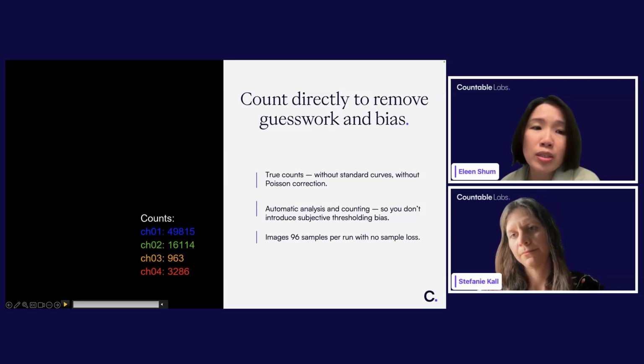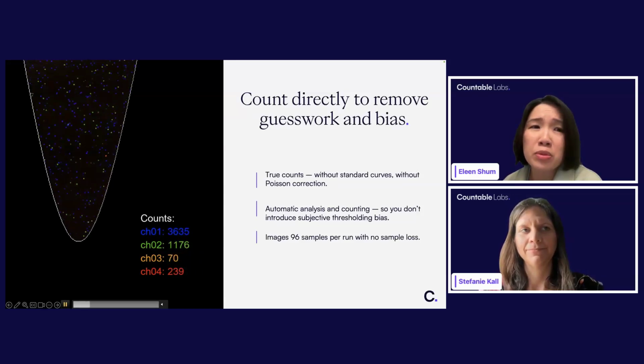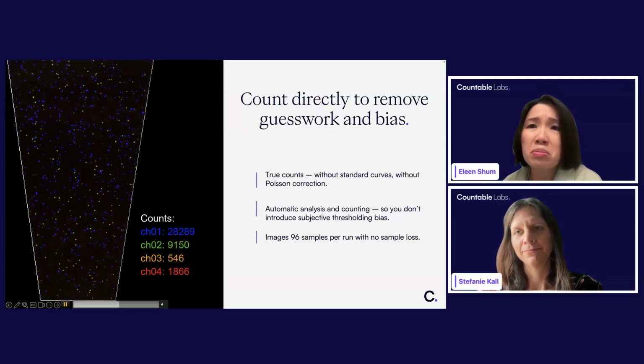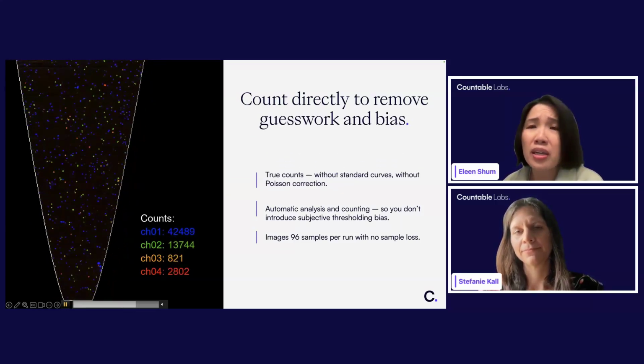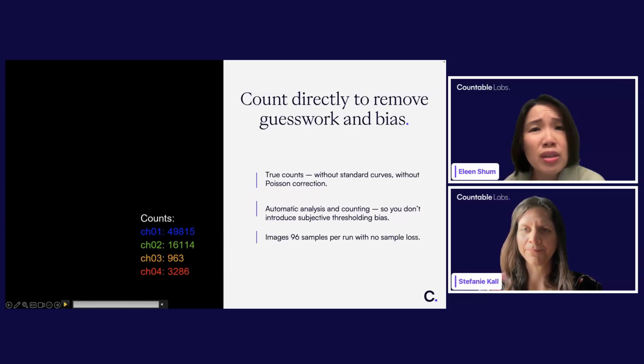Yeah, thank you. That's great. Like the video explains it all. We've done a lot of experiments. Say if I add expected counts of 3,000 molecules, I get 3,000 molecules back, or if I put 5,000, I get 5,000 back. So it's actually very linear, which proves that our ability to discern single molecules is really high.